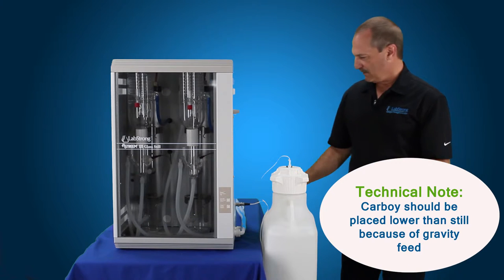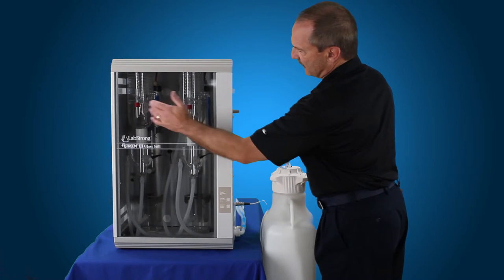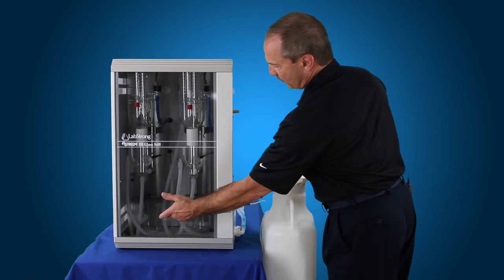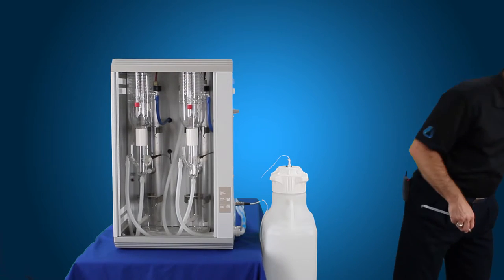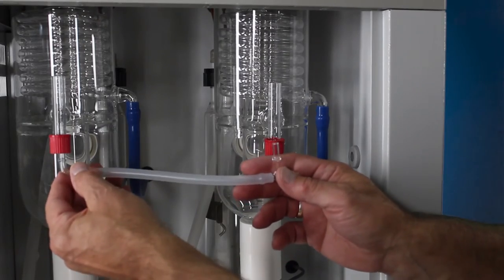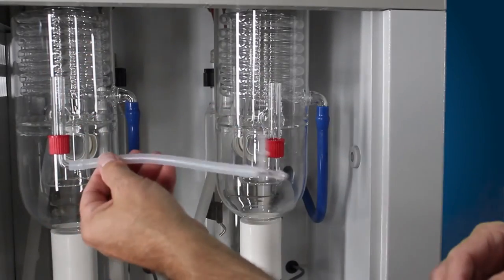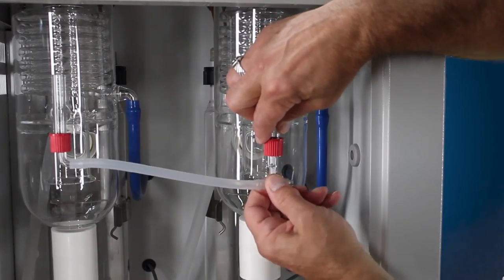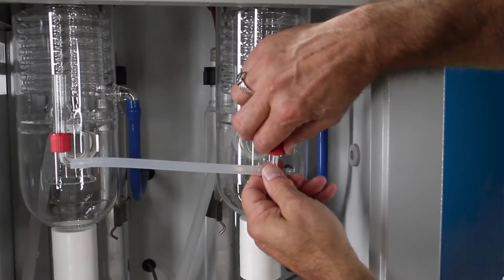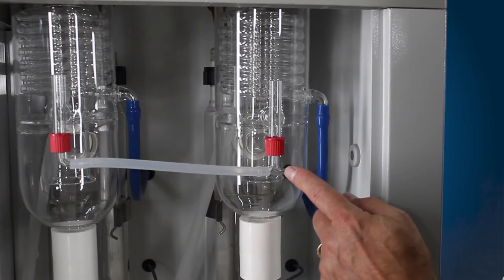Next, the still comes with a glass elbow and a T because we're going to have both of these condensers feeding directly to the tank. Remove the door by pulling up on the door, pulling out on the bottom, drop that down and set it aside. The glass elbow goes up inside this red cap — there's a seal and it just slides up inside that seal, hand tight. The water from the condenser on the left-hand side is going to feed over this way, and the water from the condenser on the right-hand side will feed into this T and then over.